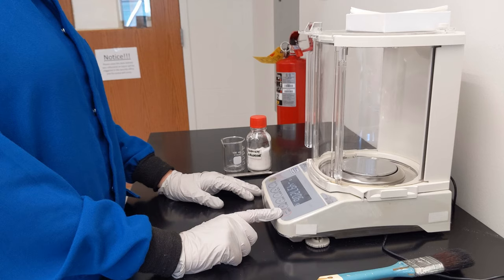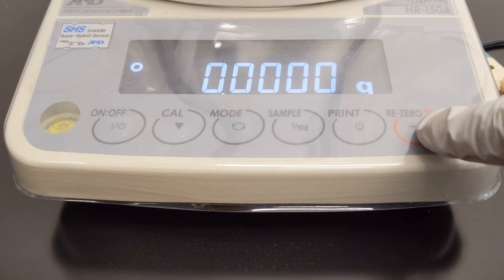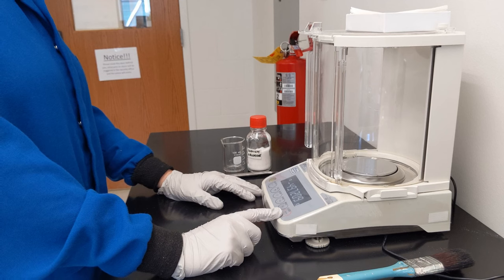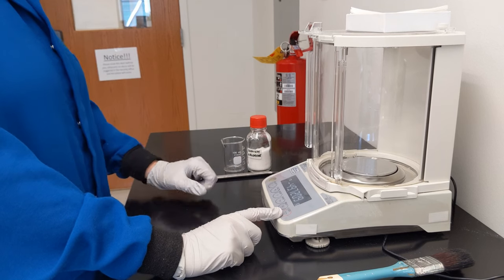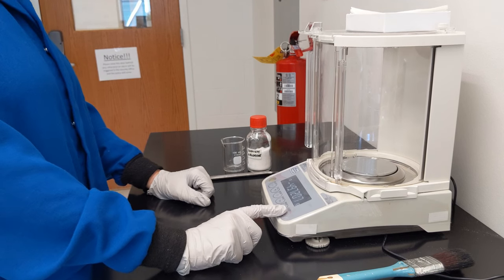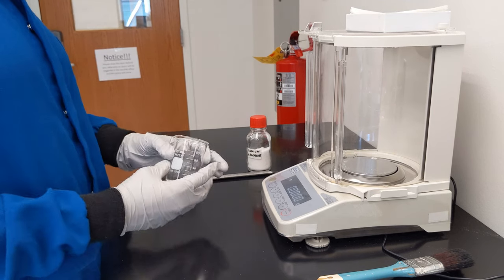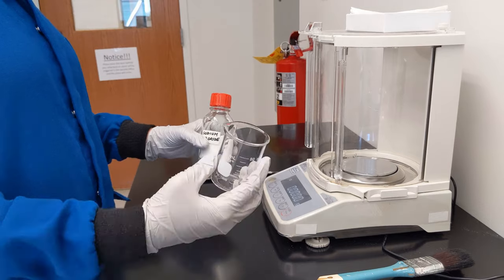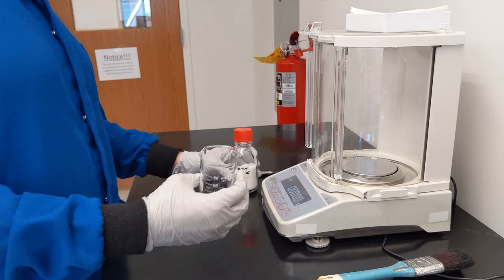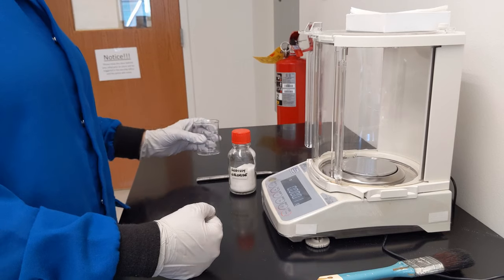The next thing I want you to pay attention to is this button that says 'Read Zero.' Other models might just say 'Zero' or 'Tare' — T-A-R-E. If you push this button, it forces the current mass to read zero and will erase whatever mass is currently displayed. This can be helpful if, say, I want to measure the mass of sodium chloride in a beaker but I don't care about the mass of the beaker itself. I would put the beaker on the balance and zero it out so that all I am measuring is the mass of the sodium chloride.